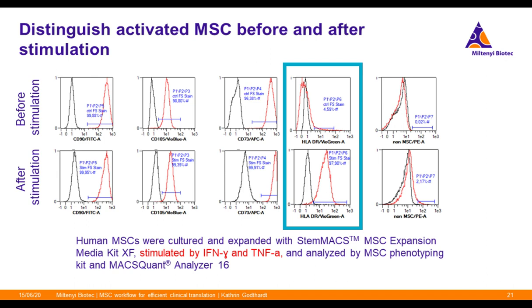So therefore it's really nice to have this marker with a separate color in this kit to analyze it separately from the other non-MSC markers. Because as you see here, before stimulation it's negative, and after stimulation with interferon gamma and TNF-alpha, the signal is quite high.